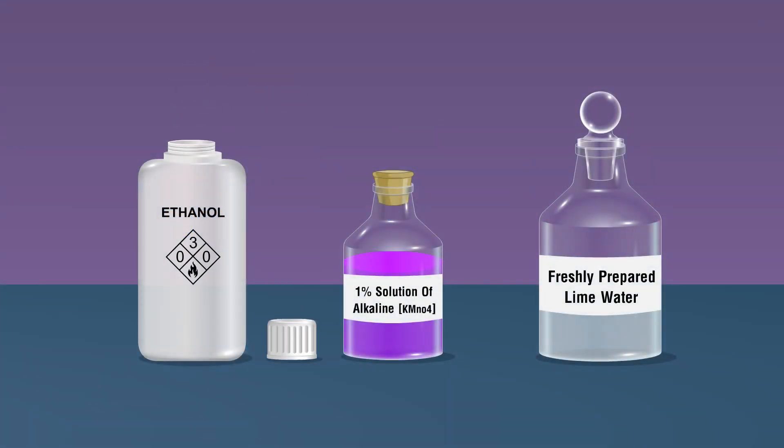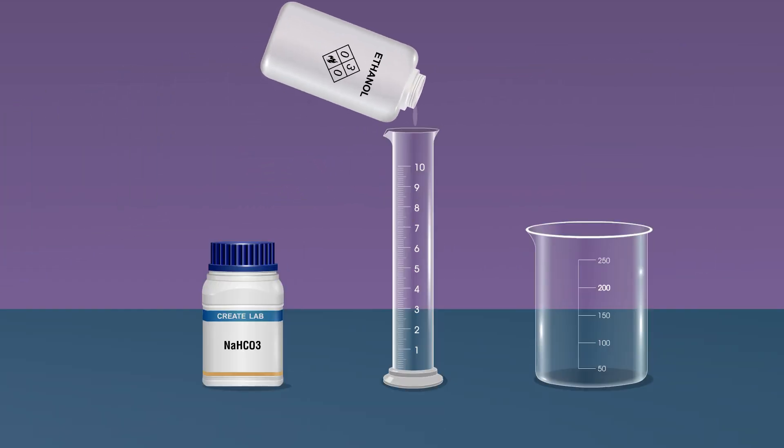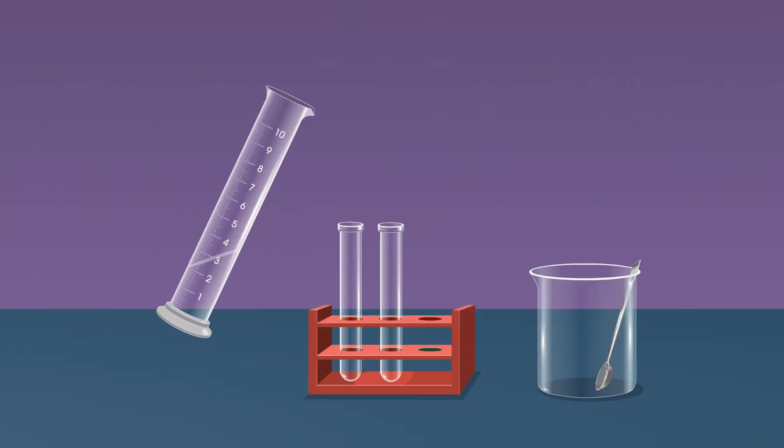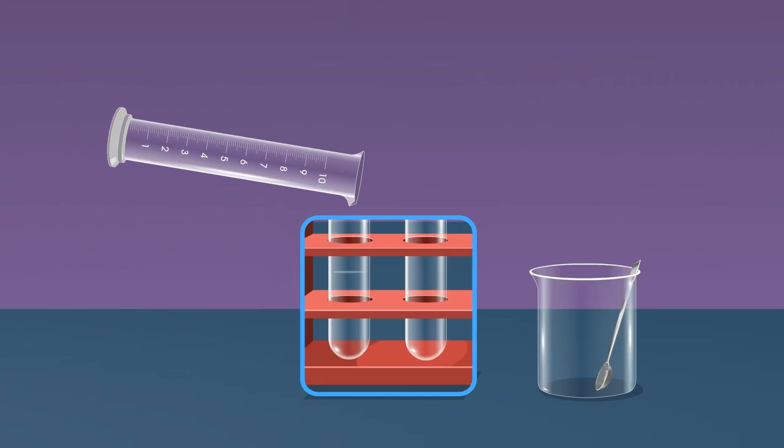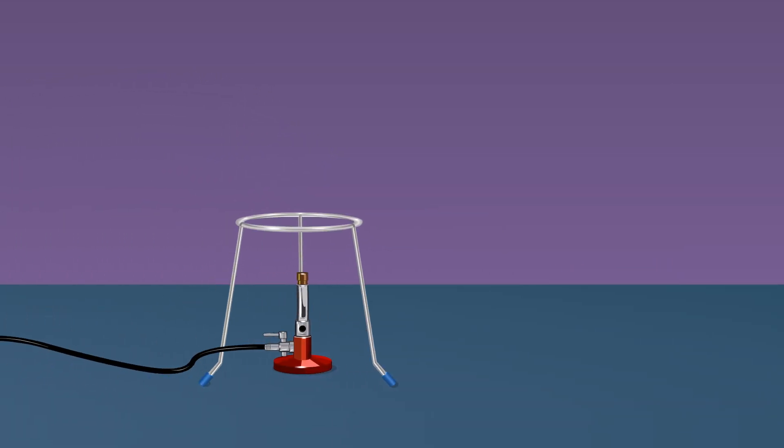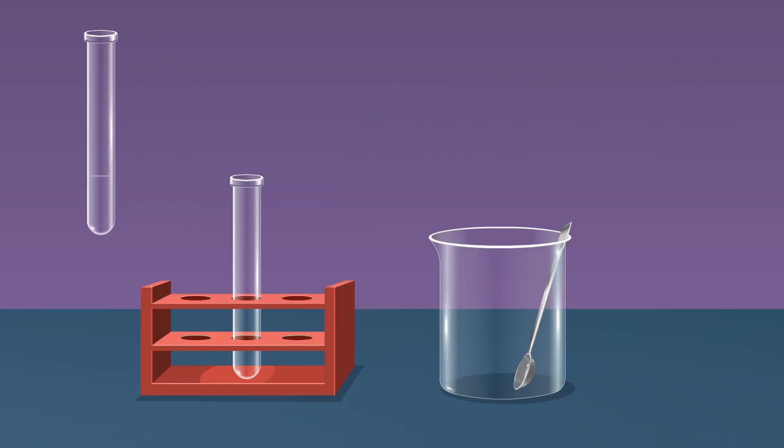Take 3 ml of ethanol in a boiling tube using a measuring cylinder. Place the boiling tube into the beaker, place a stand close to the tripod, put a beaker containing water above the wire gauze, clamp the boiling tube, and warm the solution in the boiling tube.